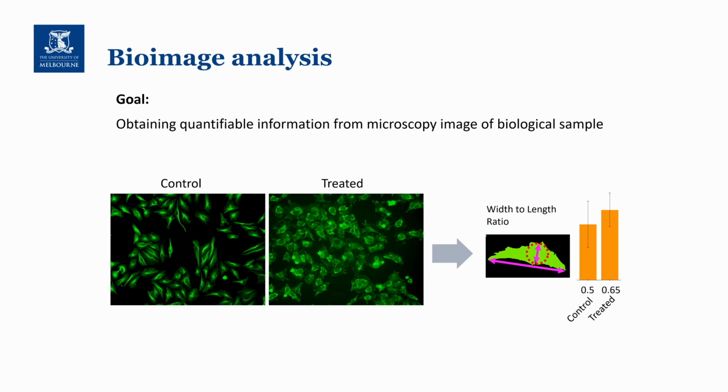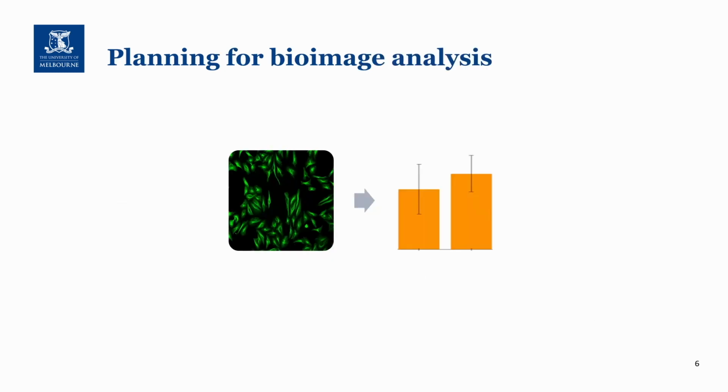In this talk, I will cover the general workflow involved in bioimage analysis, including what is required to generate suitable data for your image analysis. In many cases, researchers want to analyze images after acquiring them, only to find out that the images that they have acquired are not suitable for quantification. So I will cover the steps needed to generate images with good enough quality to properly carry out the analysis and end up with good results.